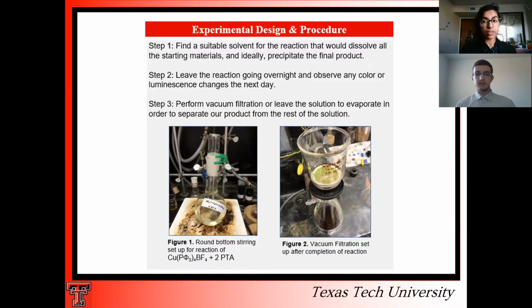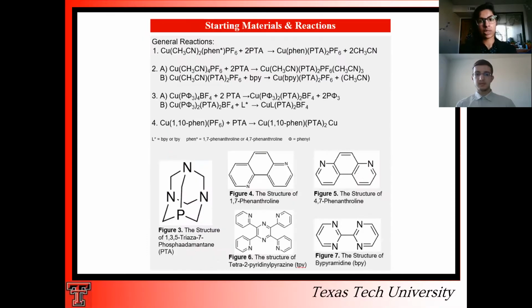It's going to be in the flow through, in the solution that's aqueous, because if we have PTA in our compound, we're hoping that it would be water soluble, and so it should be in that solution rather than on top. But let's say we're on an intermediate step in our reactions, then most likely our compound is still insoluble, and so we would find it on top on the filter rather than in our solution. So Dzmitry is going to be going a little bit more in depth into the actual reactions that we're doing.